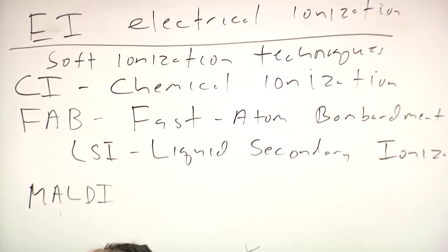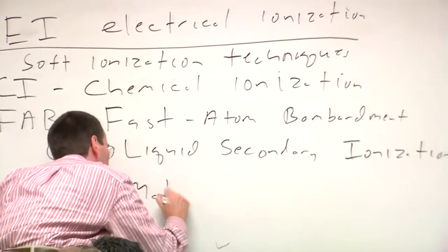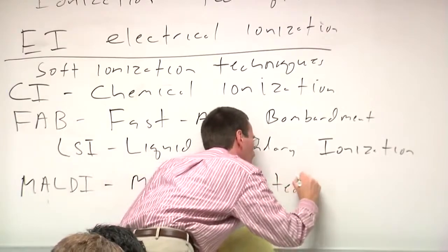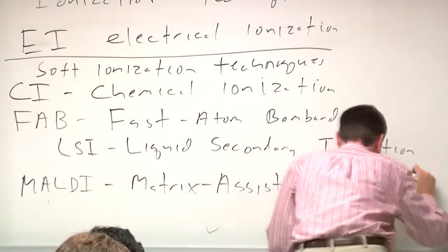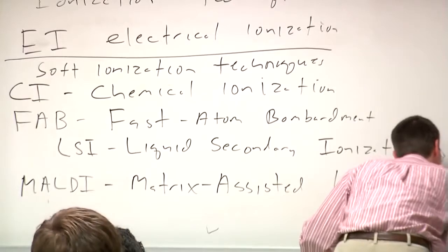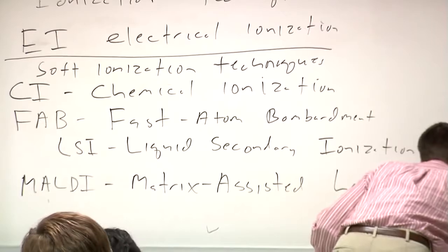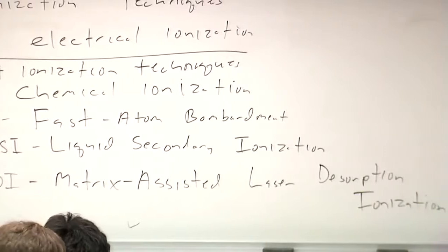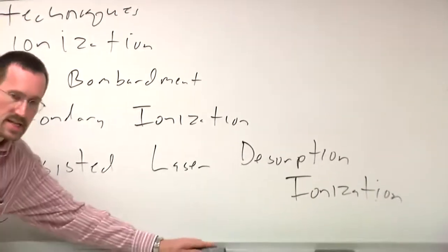It's matrix-assisted laser desorption ionization. Talk more about all of these techniques in a second.